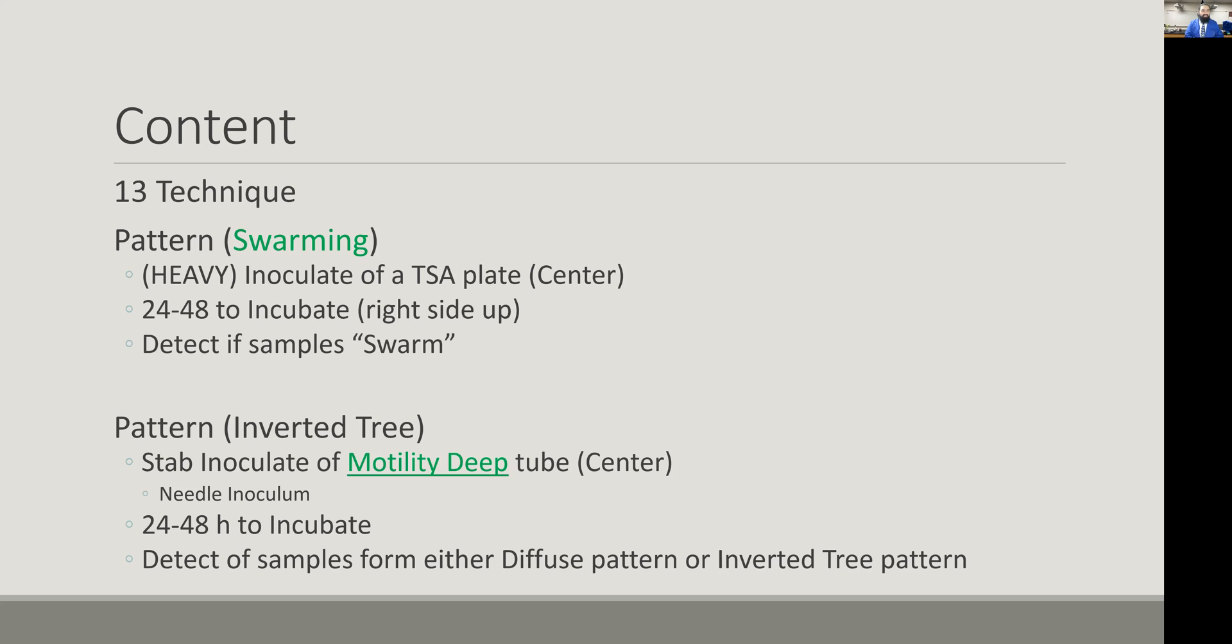The second portion of lab 13 uses a very unique type of medium designed to observe motility in a tube called the motility deep. These are slightly shorter tubes with lighter media containing a specific color marker. When the organism grows and consumes it, it reflects a red color, so we can see where inoculation occurs. For this, we use a needle inoculum instead of a loop—it's a flat needle missing the circle at the end.